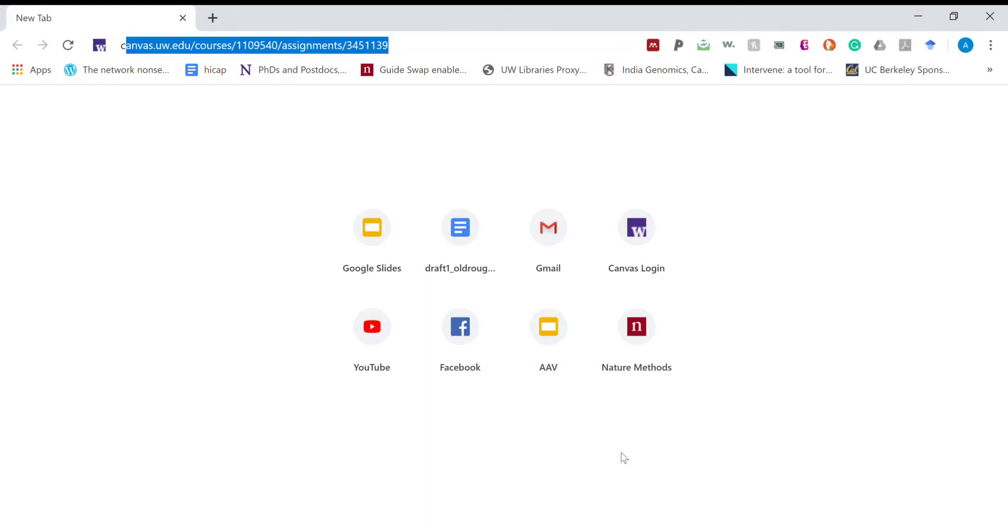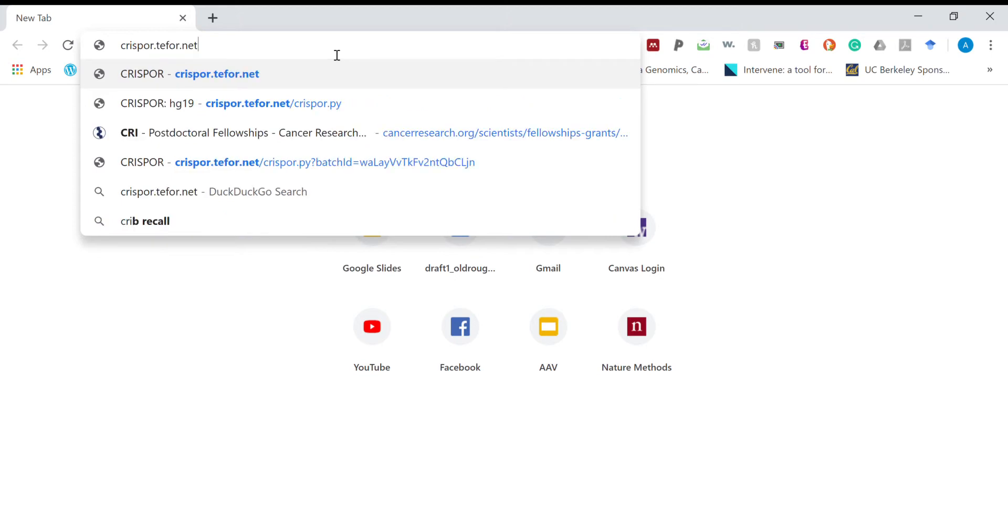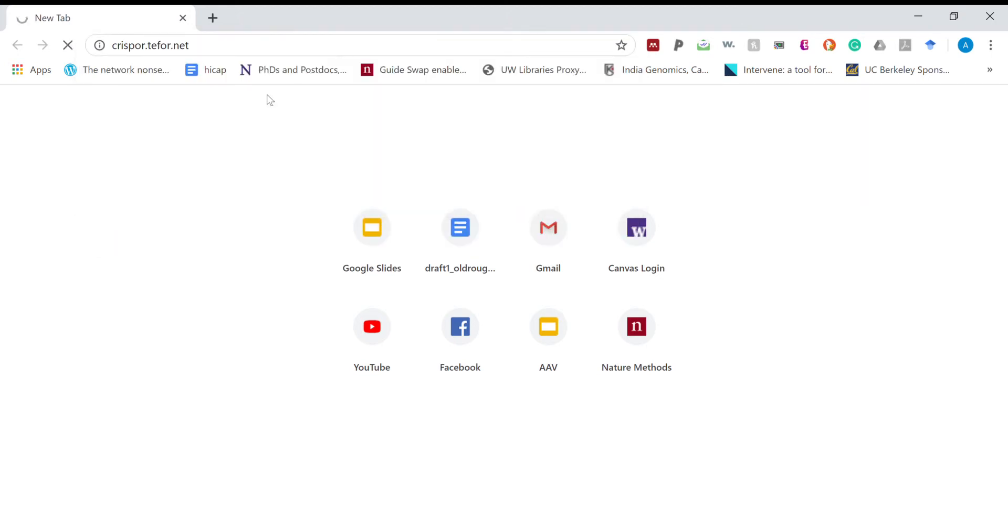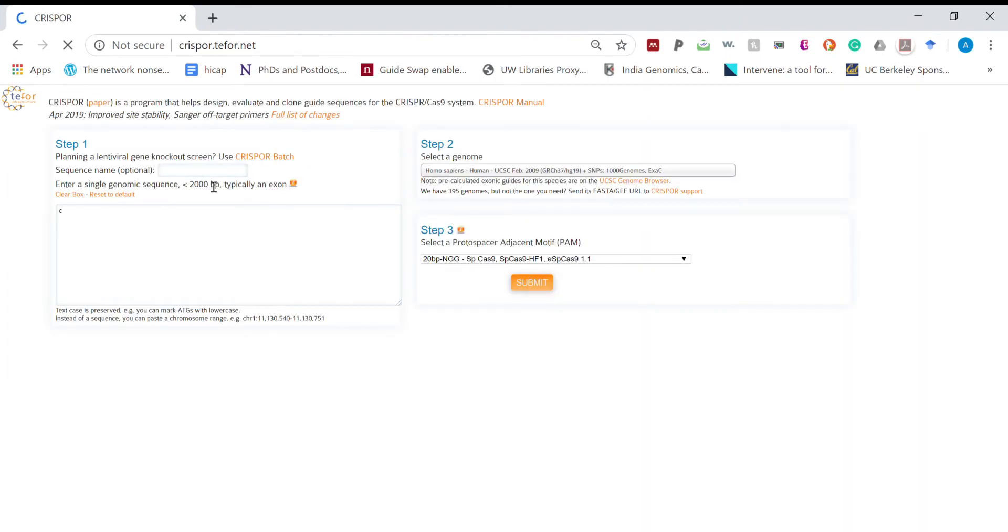First open CRISPOR site. Now give name to the genomic location of your interest.